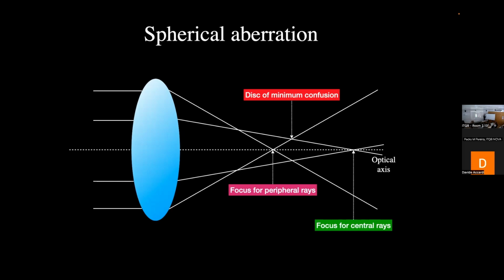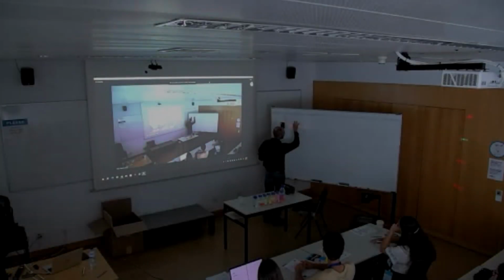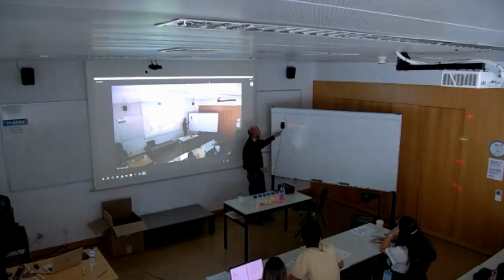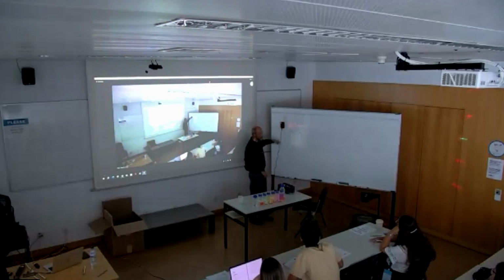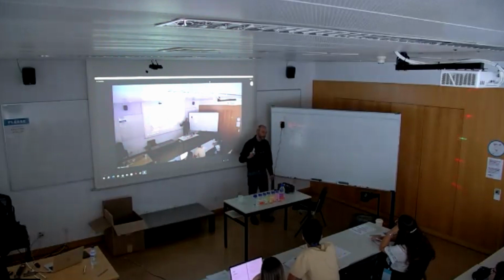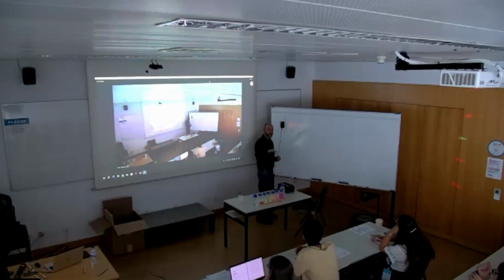a good image. And then here we have several rays of light parallel, and I shall put a converging lens in front of them, and then you might need to get closer to see well. But our green laser identifies the optical axis, and we have peripheral rays and internal or central rays of light. And you will see here that peripheral rays are focused before the central rays, as I showed you in the scheme before. Do you manage to see also from the distance? If you want, you can quickly come close and have a look there.